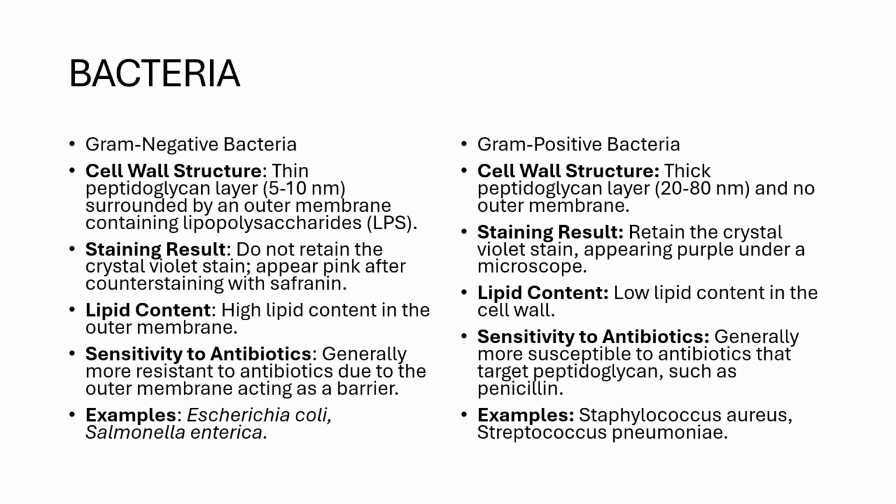It is done because the gram positive bacteria are less resistant to antibiotics, whereas the gram-negative bacteria are more resistant to antibiotics. So to identify that, there's a staining procedure where a dye, a crystal violet stain dye, is used, and based on that dye, the gram positive bacteria will retain the purple color of the dye, whereas the gram negative bacteria won't retain it.